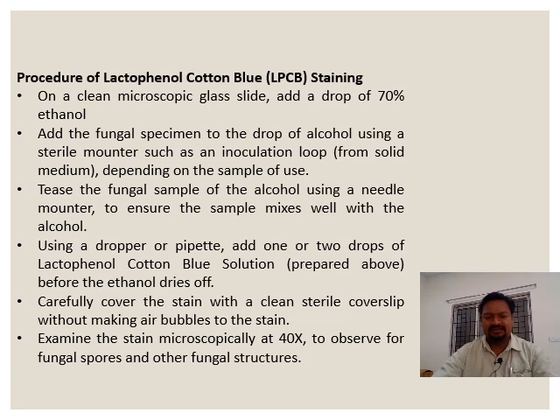They are listed on the product labels. Lactic acid, glycerol, phenol, containing phenol crystals dissolved in distilled water, and an aqueous solution of 1% cotton blue or aniline blue. The procedure of lactophenol cotton blue staining.